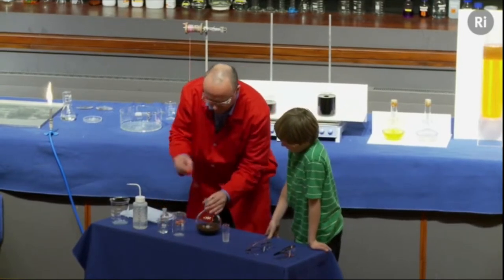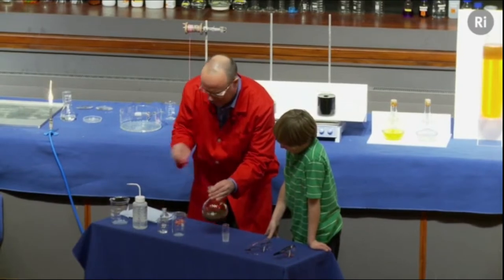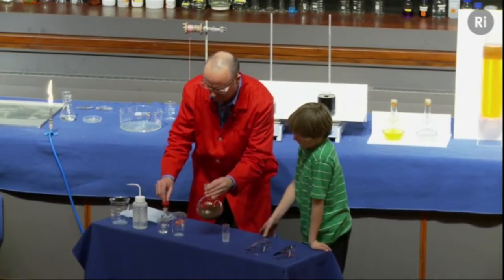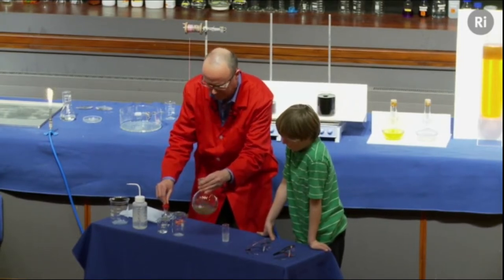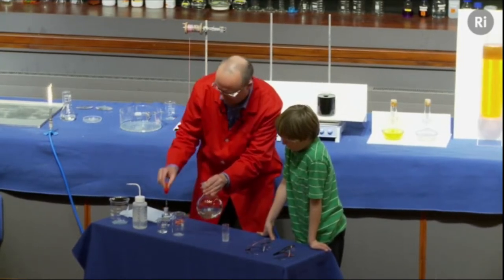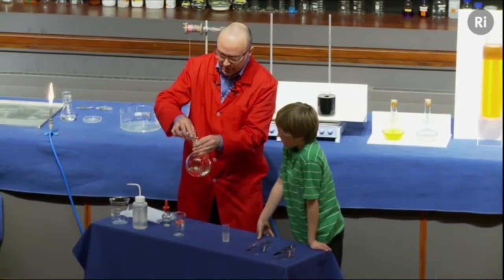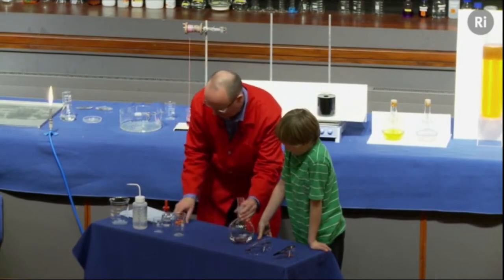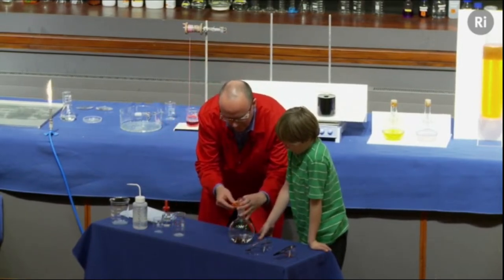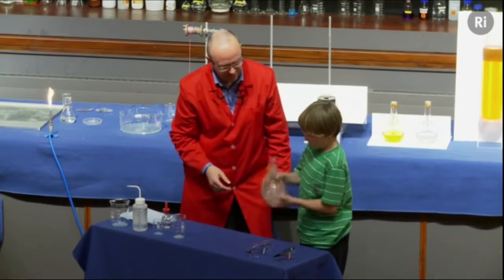So I'm now going to add more ammonia. And again, I'm going to add ammonia until the liquid goes back to being colourless. This takes a moment or two. There we go. And then finally, I'm going to add some glucose. So there's the glucose. Now I'm going to put the lid on, put a clip on. I'm going to give it to you, Dylan, and I want you to hold that. And I want you to give it a really good shake.